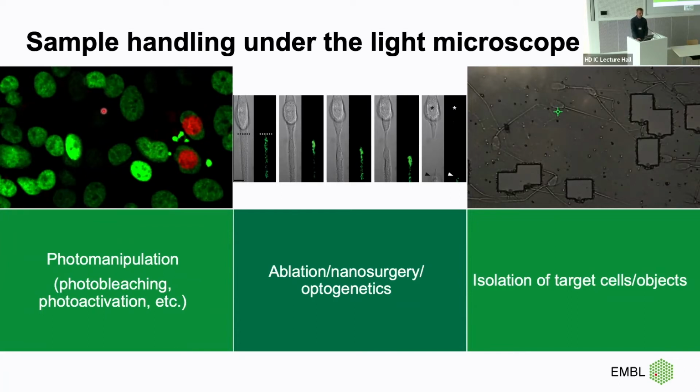So, and as I said already, we have a lot of photo manipulation, photobleaching, photoactivation experiments, which I would present, but we also have projects where we need, for example, to ablate the cells, or where we need, as was already discussed in the first session, to isolate the cells with laser microdissection and so on and so forth.